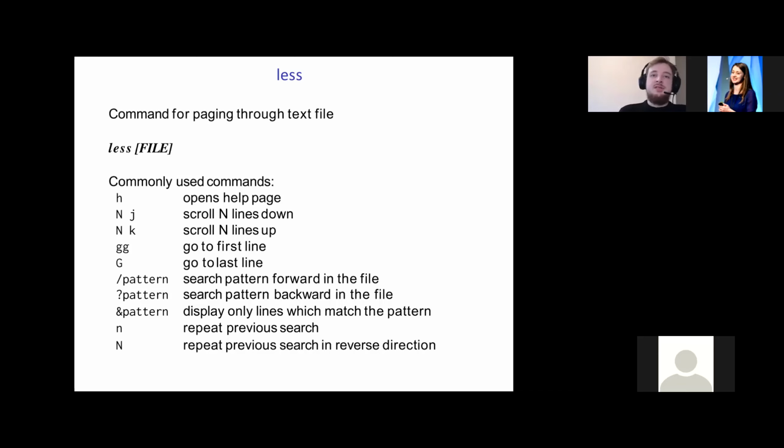Basically, we often have a very large file, which is often the case when we are working with genomics data. Those files can be many gigabytes or often larger, even hundreds. Normally on Windows, when we want to look at what's inside a file, but only want to see the first 5 lines or so, we would have to open it in Notepad or Word, but it's not realistic to read the whole file into memory.